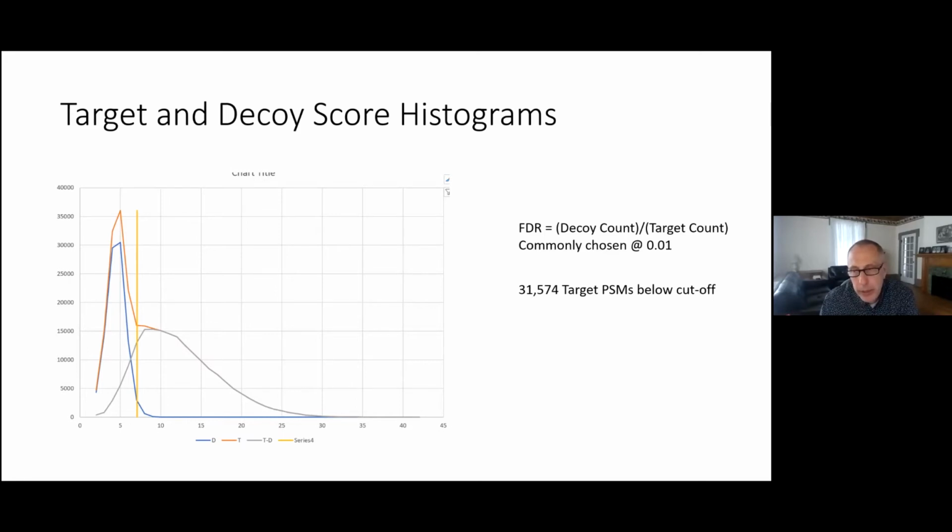And so there, it's not unusual to go to 5%. And that's simply a grab. Does that make sense? We didn't see anything interesting in the 1% list, and so we go to 5% in the vain hope that some more interesting proteoforms will show up. Yeah. But I think it's not such a problem for bottom up.